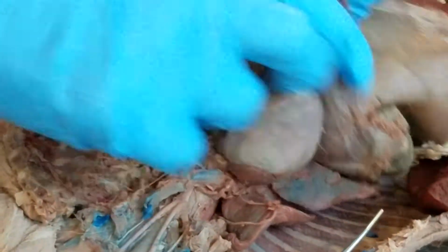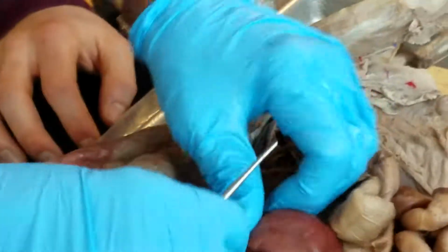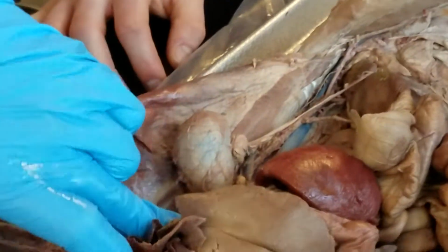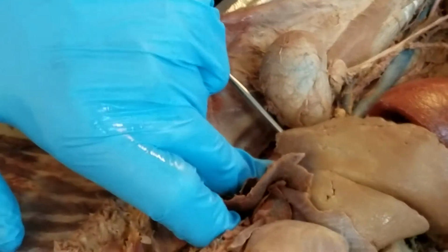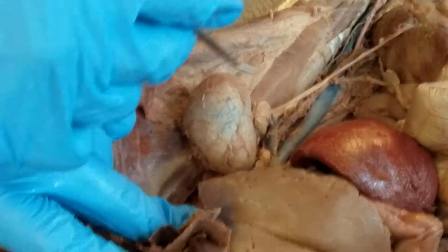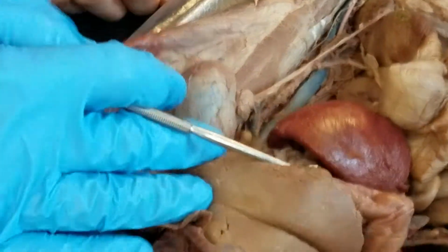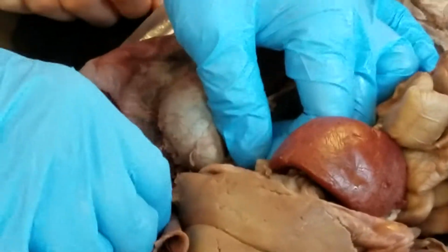So here's our diaphragm. So we move everything over now so we can see. As we move it all over, when I cross this point right here, I'm now in the abdomen, so I'm no longer in the thoracic cavity. So now the aorta becomes abdominal aorta, and there's your inferior vena cava. The first major branch is going to be celiac trunk. There it is. The celiac trunk is going to give me 3 branches.